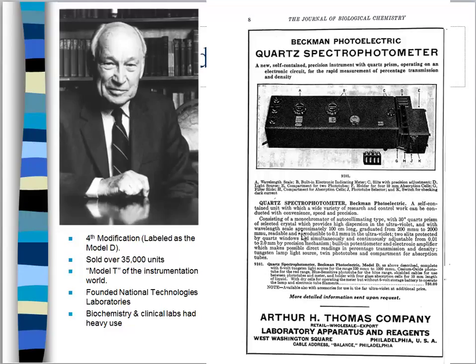And of course, clinical labs and hospitals and clinics and doctors' offices would love this type of instrument. And it's a very common laboratory instrument that you would see across the United States. So that's where it's made its home. That's where it began to get known. And that's Mr. Beckman. So we can give him a round of applause for making this instrument for us.